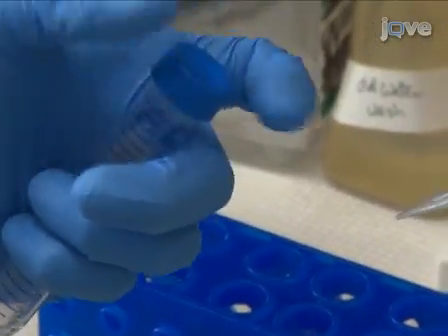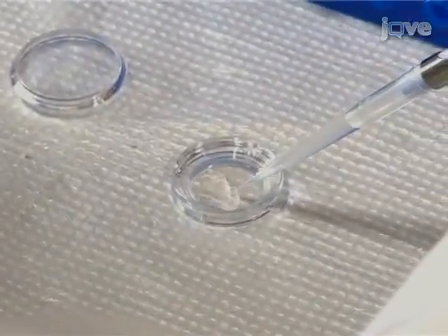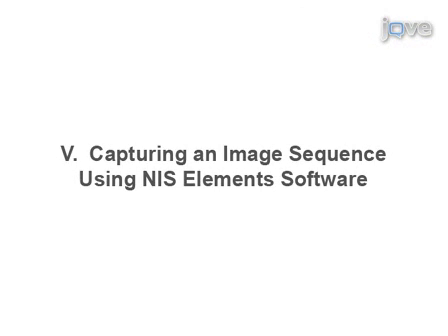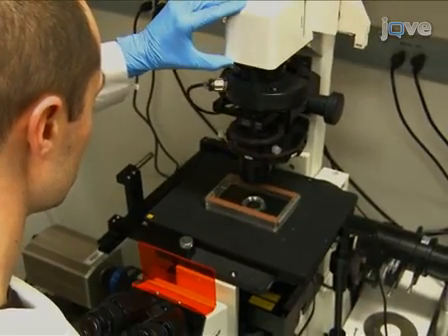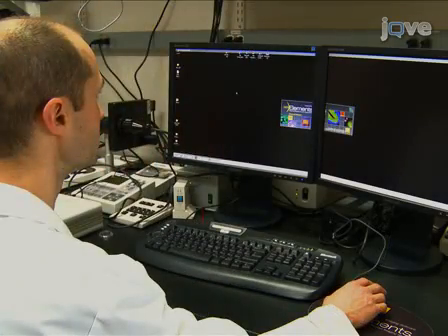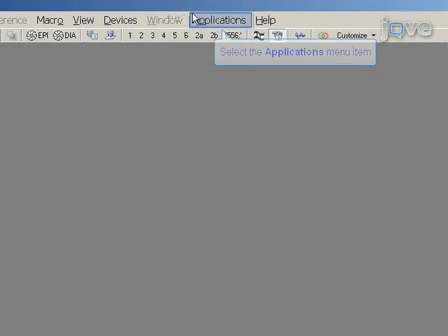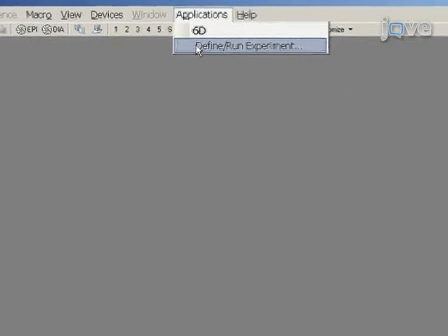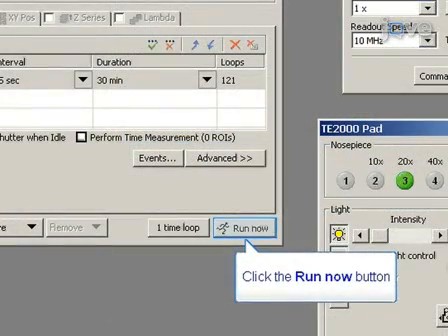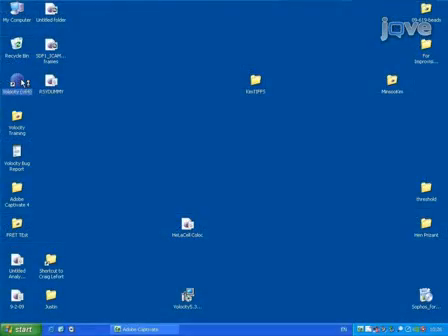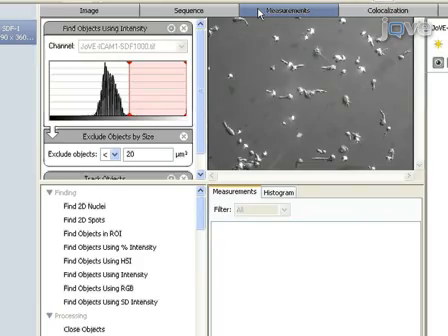Transfer the T-lymphocytes in 1 milliliter of media to the dish. Approximately 2 to 5 times 10 to the 5th cells should be used per dish to achieve a cell density appropriate for migration analysis. To obtain images of cell migration, place the dish on the microscope stage in a temperature-controlled environment such as a heated chamber at 37 degrees Celsius. Open the NIS Elements software. In the Image Settings menu, choose 2x2 binning as the mode for both live imaging and image capture. Go to the Applications menu and choose Define Run Experiment. Choose the length of time between images and the total time for the image capture sequence. Press the Run button to begin image acquisition. Following the acquisition, migration parameters such as velocity, path length, and displacement can be quantified using a software package such as ImageJ, AutoQuant, or Velocity.